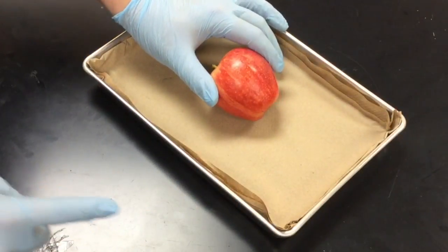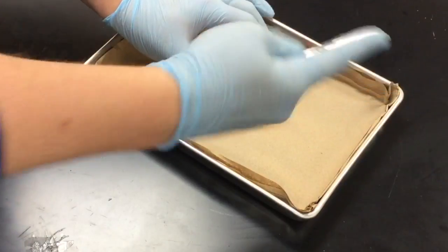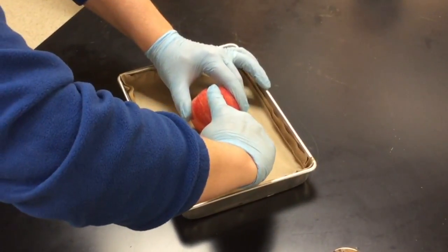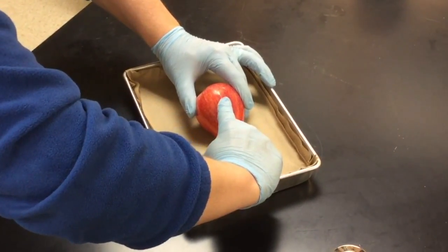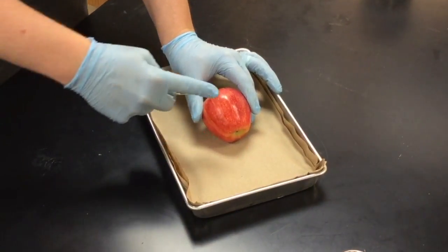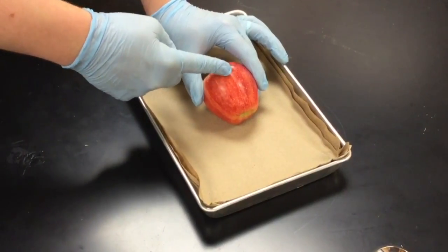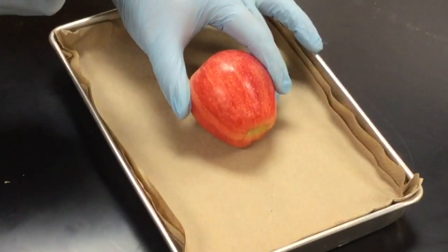So as you can see, I've taken it, moving away from my body itself. I take the scalpel and I'm going to make the incision while I cut away from my body and also cutting away from anyone in my lab group. Now, as you can see, I made one clear cut, one clean incision that went deep into my specimen.